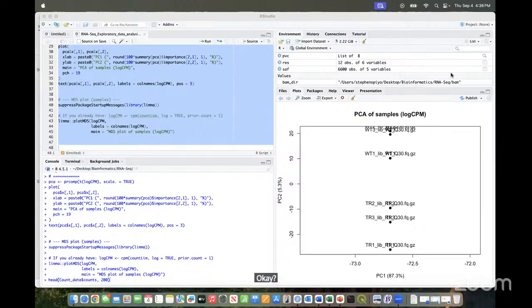Let me see another question here. Q&A. Invalid parameter. No counts were generated. Okay, so let me see why here.